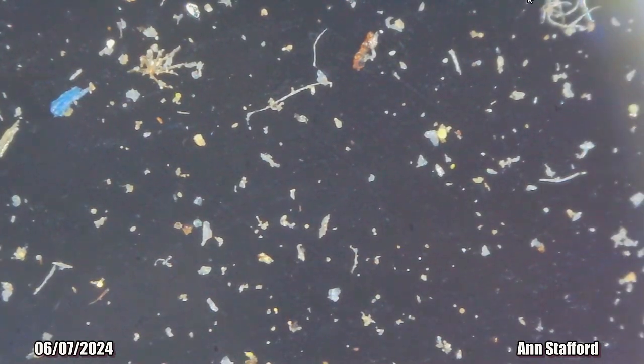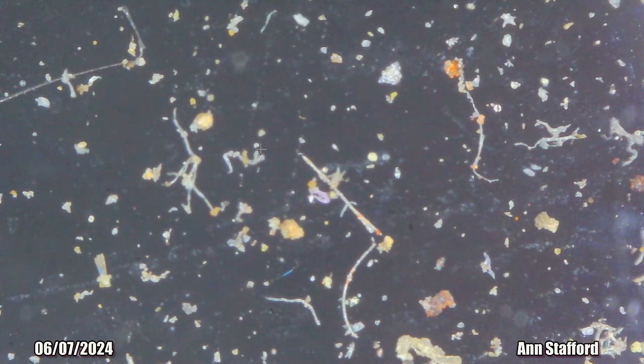One thing I am noticing now is you'll see this little, it's almost like a little heart or a V right here. I've noticed that a lot of these little animals will have a tentacle, at least one tentacle, that has this little V, whatever this is. I think it's probably meant for pinching, grabbing, holding. I don't know. I don't see them move. I know that they do have to move, but this is something I've begun to notice. See that? Where else did I see one? But the little V is something I have begun to notice in the last couple of days.